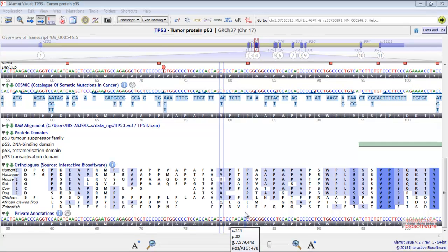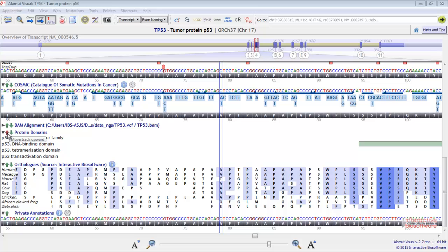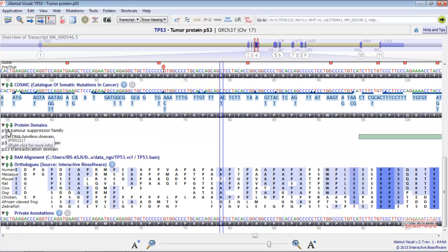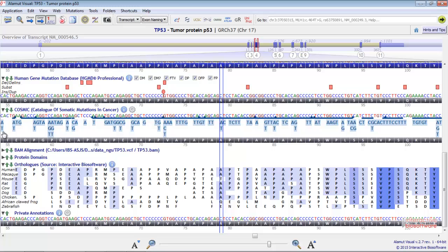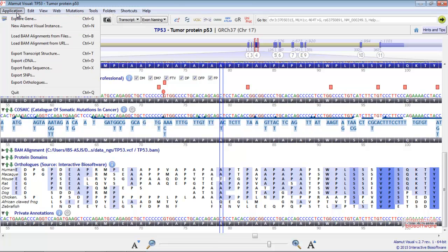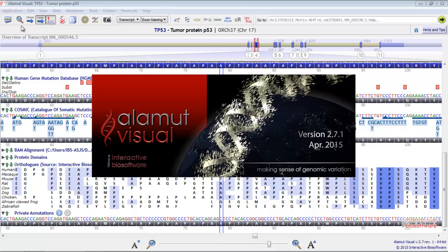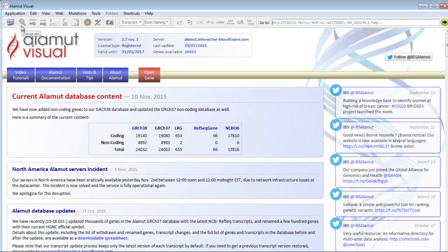In Alamut Visual, you have the possibility to move the tracks upwards or downwards like this or to hide them like this. You can also launch several Alamut Visual instances if you want to display several genes from the same computer. In order to do so, you need to go to the menu Application, New Alamut Visual Instance. A new window will be opened.